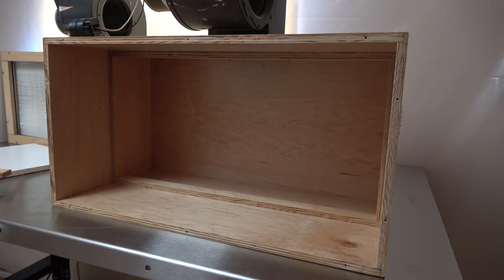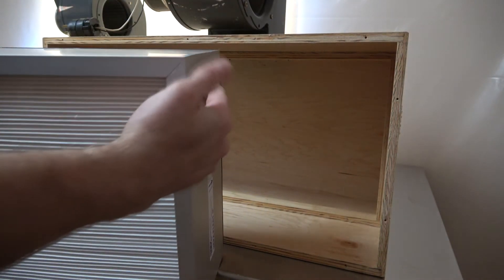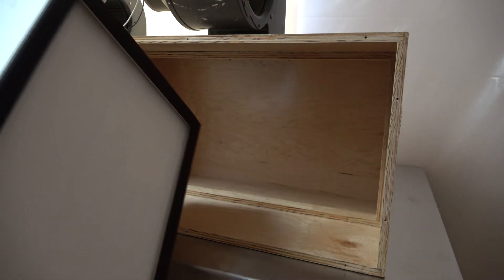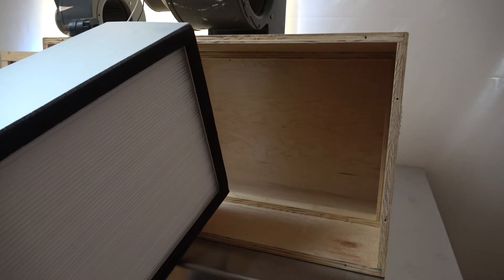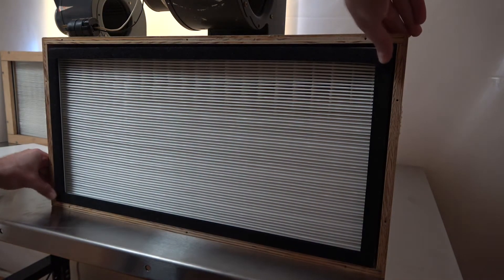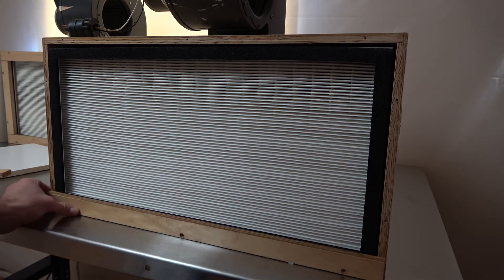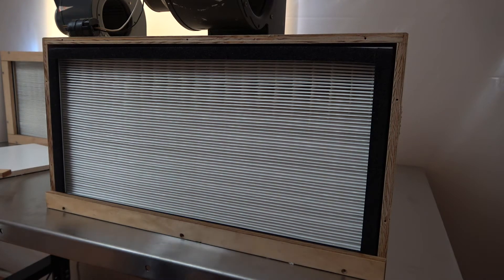I've wiped the inside of this filter housing out with some bleach wipes — did the outside too, just to give it a general clean up. Now I'm going to put the new filter in. You can see the pleats in it — it's a fabric filter. Notice that one side is bare and the other side has the gasket. You want the gasket side to be facing towards the front, because that's where your framing will press up against it and seal it. It's a very quick and easy replacement job, so kudos to fungi.com for making it easy. Then I'll just screw the framing back on and it'll be ready to go.